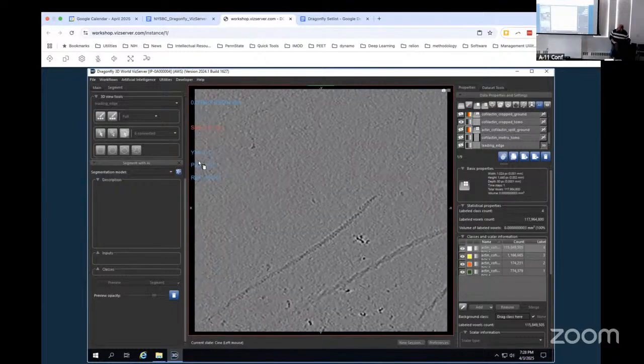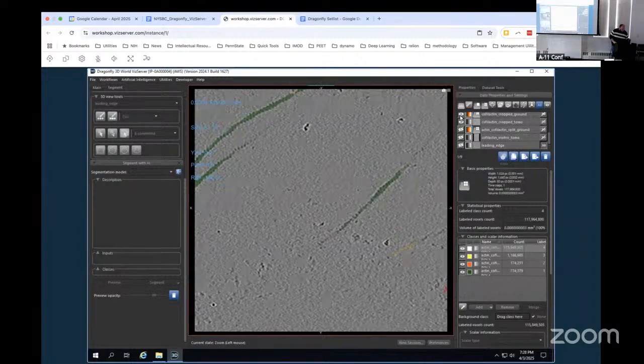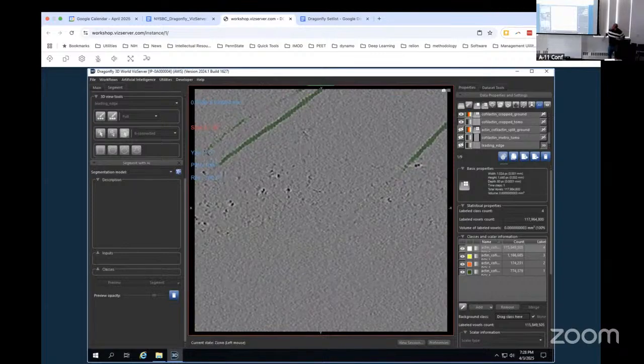And so what we did here is we cropped this out in a region where we had a bunch of, in fact, maybe we can turn this on. No. I want to show you the finished product here. Basically, we went through and pushed all of those specs, right? These are no longer in this segmentation. We pushed them all into the background and retrained.